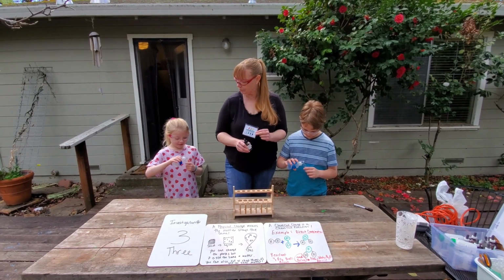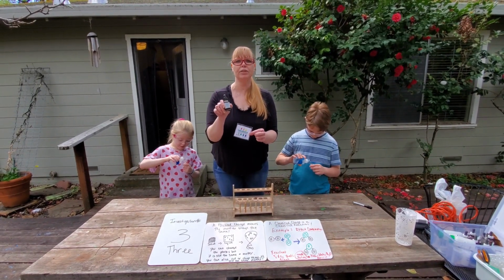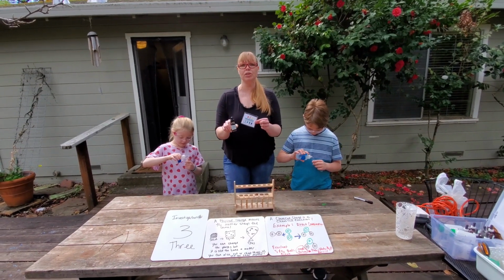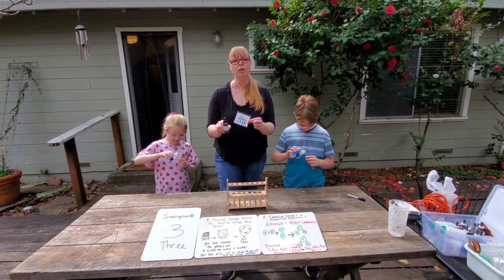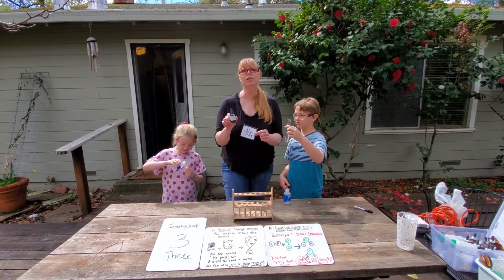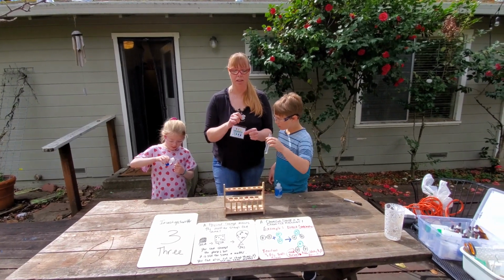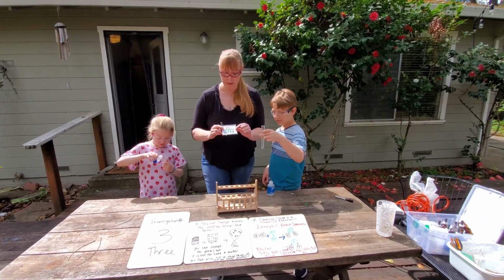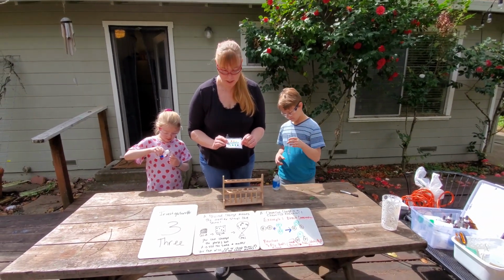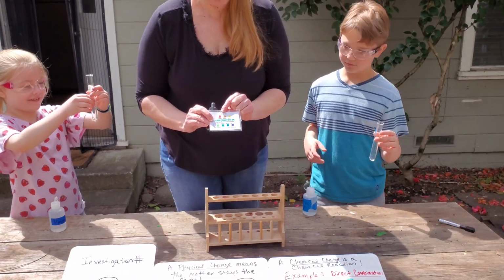Go ahead. What I have here is a universal indicator. I don't know if you guys remember doing some of this with ocean acidification and bromothymol blue. But these, or the cabbage juice that you guys did, change colors when they're in different pH. Remember pH, is it an acid or is it a base? I don't know if you remember that lab, but this color chart will tell us whether or not we have an acid.